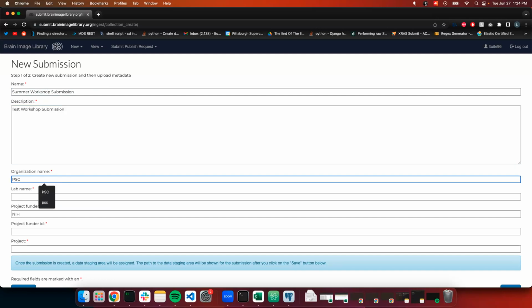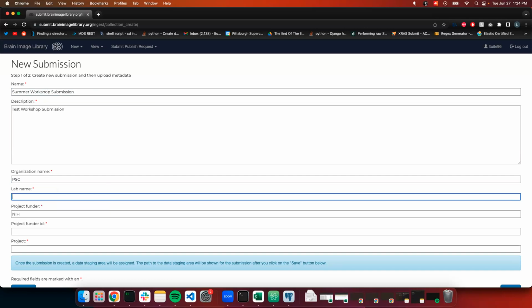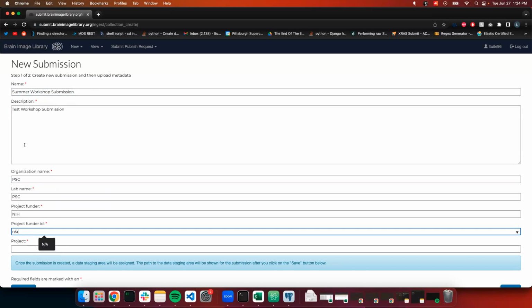I'm with the PSC. My lab name doesn't really matter for this. I'm just going to say the PSC as well. Project funder ID, your project funder ID. So the grant number that you're associated with for submitting data. For me, it doesn't really matter. Again, we're just doing a test case here.